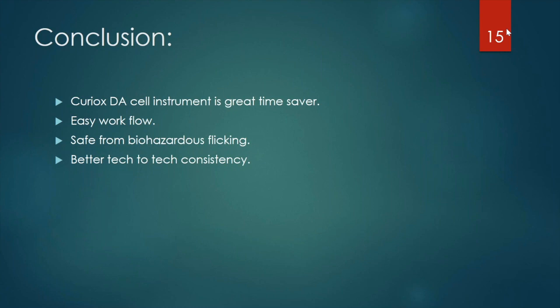Next question, have you used the larger volume plate insert? Larger volume plate insert, I did not use. Curiox has it, which they're testing for single antigen bead assays. They have some kind of inserts for that, but I haven't used it for flow cross matching. That's an interesting thing. Maybe I should test that, but I haven't used it.